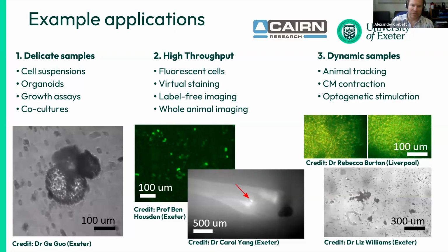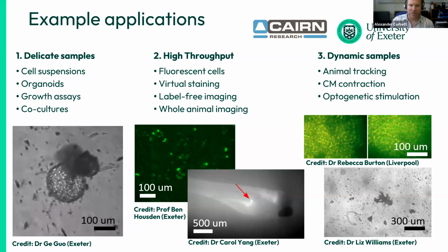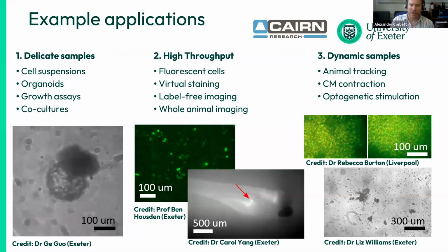We can do fluorescence imaging. We've got images there of a fluorescent pancreas in a zebrafish. Hopefully you can see that, as well as some fluorescent HEK cells. We can do label-free imaging as well using this phase contrast modality.